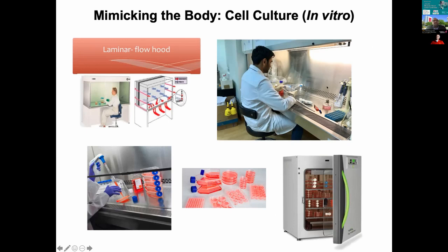Inside of here, it's sterile because our immune system is protecting our body from bacteria and viruses, and we want to study the cancer cells. We have to do it in a sterile environment so that what we are actually studying is the tumors and not the fungus, the viruses and bacteria that are floating within the air. So we do everything within this sterile environment, in what we call cell culture hoods. We grow our cancer cells in what we call media. This is solution, so this is food for them. We give them nutrients. And if we're studying, for example, dormancy, we give them fewer nutrients. Or if we're studying, let's say, brain metastasis, we give them nutrients that are similar to the brain environment, the food that our brain receives.